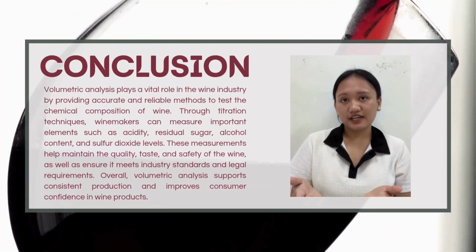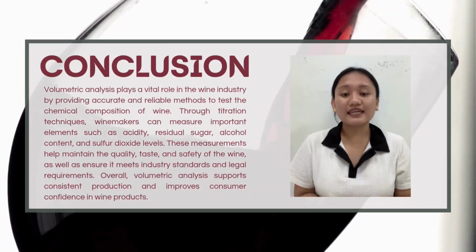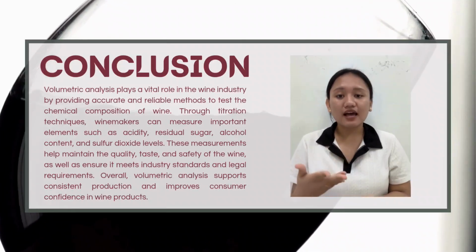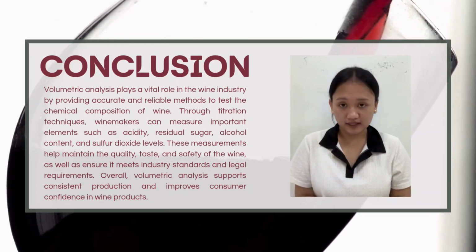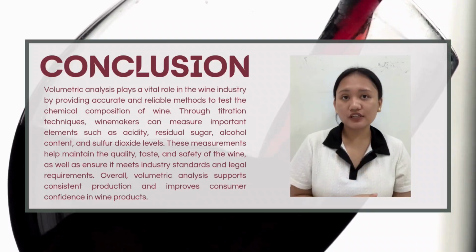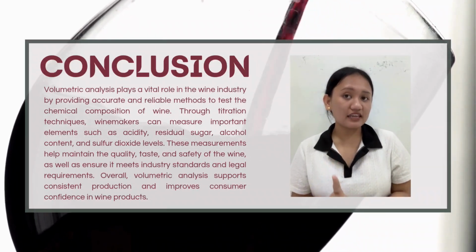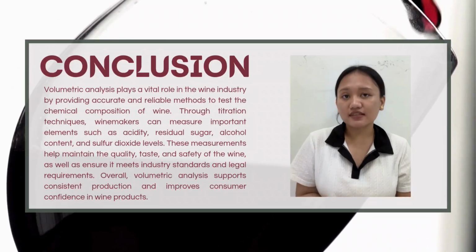In conclusion, volumetric analysis plays a vital role in the wine industry by offering accurate and reliable methods to determine the chemical composition of wine. Through titration, winemakers can measure key elements such as acidity, residual sugar, alcohol content, and sulfur dioxide levels.